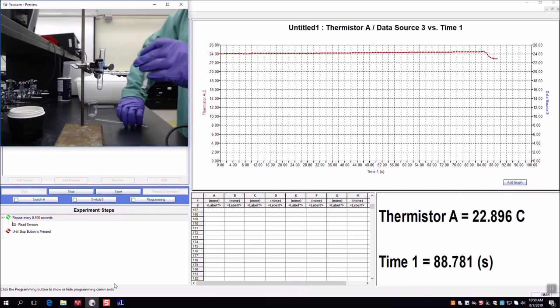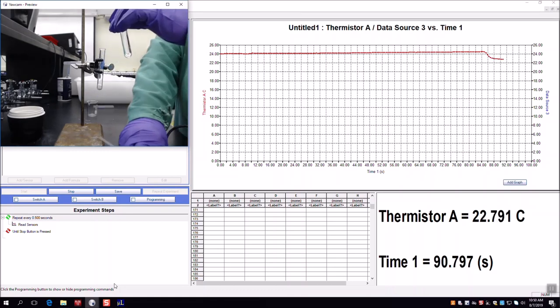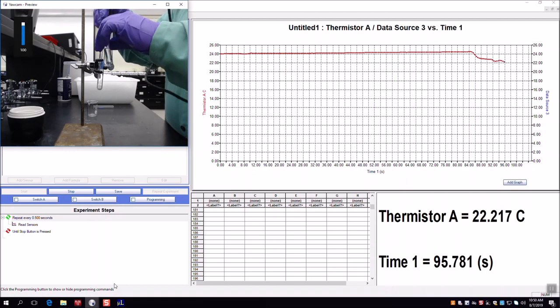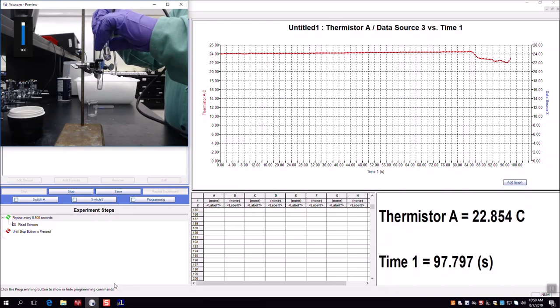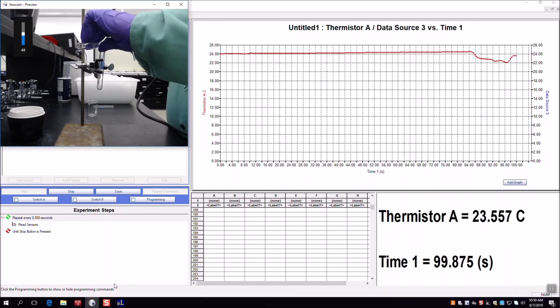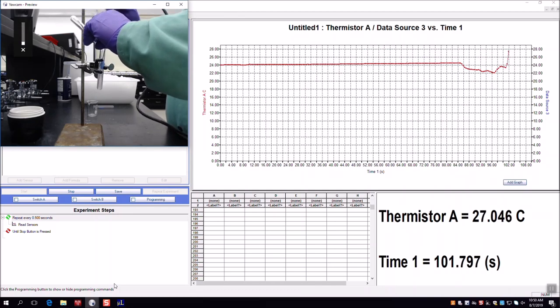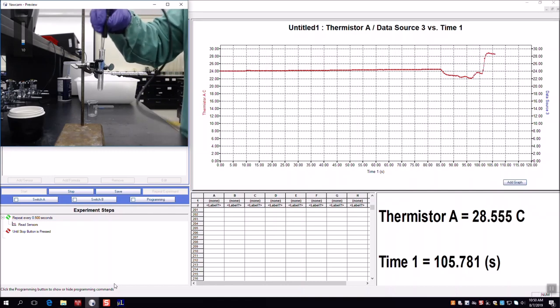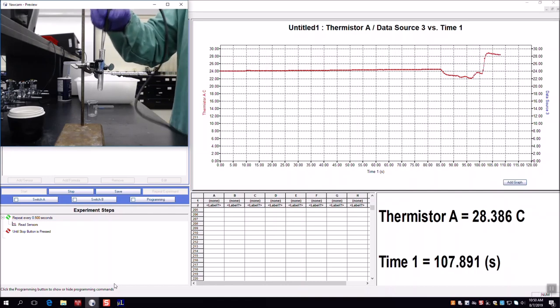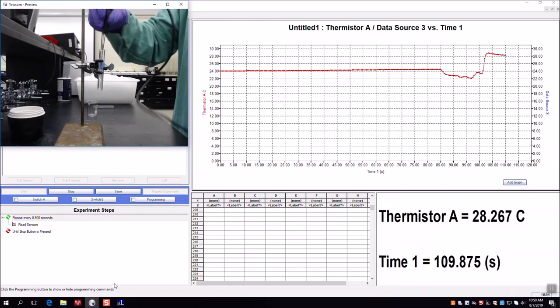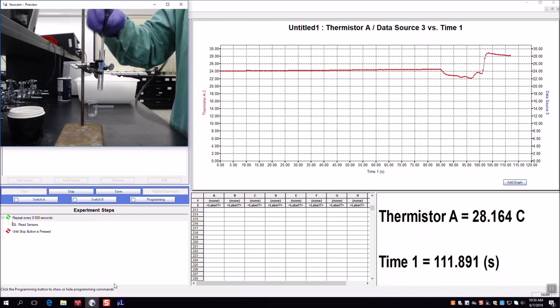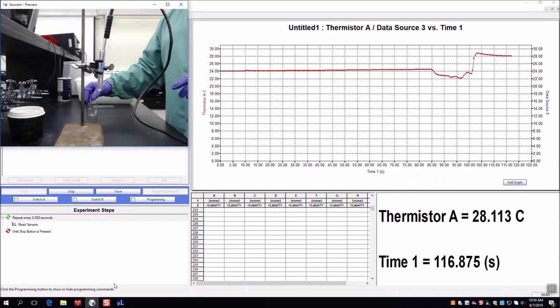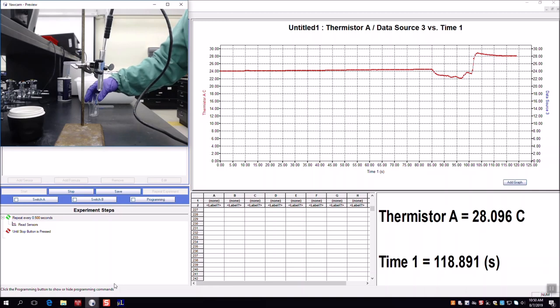I'm going to take the thermistor out, pour my water in, and stir vigorously. You'll see that the temperature has spiked up — and that's it for this portion of the experiment. Our temperature is starting to come back down, and eventually it would return all the way back to the initial temperature.